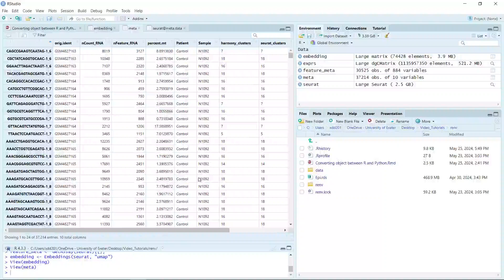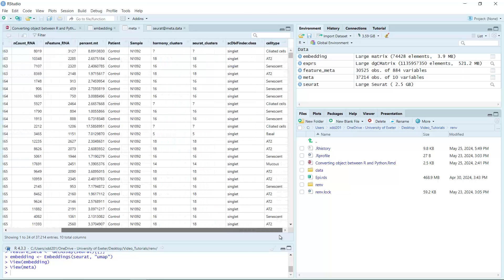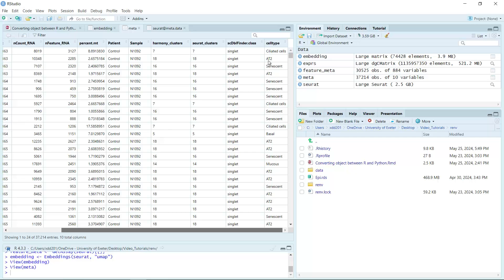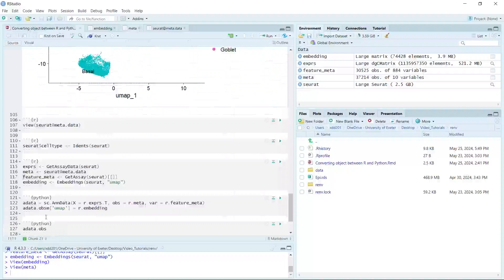You can see I showed you the metadata already for the Seurat object. If you have a look now, we have the cell type information. So we have all the data we need.